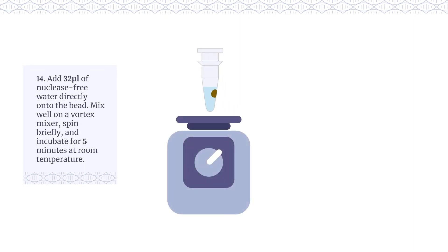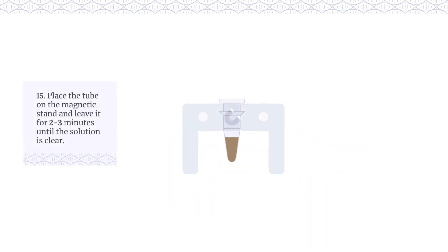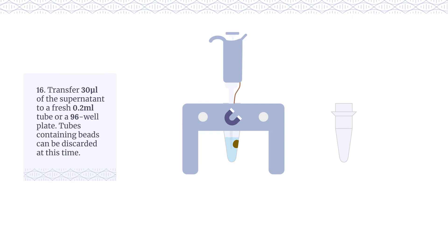Mix well on a vortex mixer. Spin briefly and incubate for 5 minutes at room temperature. Place the tube on the magnetic stand and leave it for 2-3 minutes until the solution is clear. Transfer 30μL of the supernatant to a fresh 0.2ml tube or a 96 well plate.